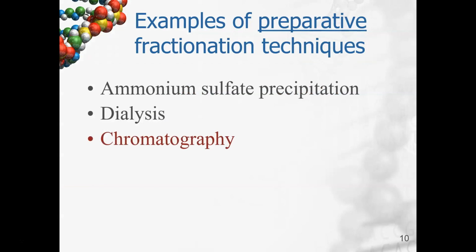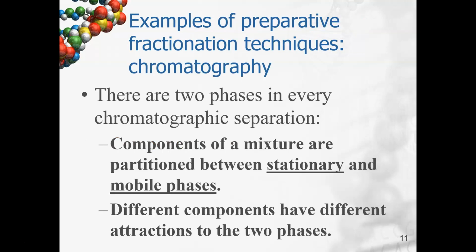Okay, what's next? Chances are a lot of the ammonium sulfate precipitations haven't just isolated one protein. There's probably a number of proteins there. So after we've removed the ammonium sulfate by dialysis, we'll do chromatography to do further separation.